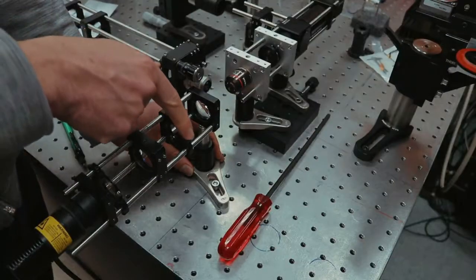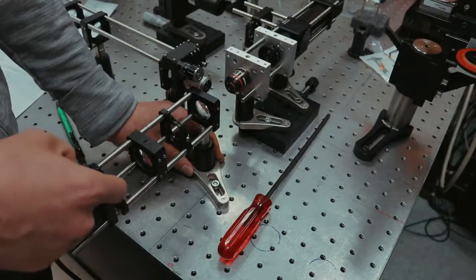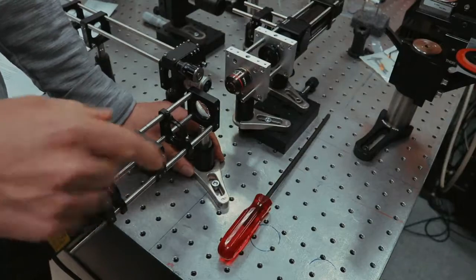Progressively close the field diaphragm until an image of its edges appear on the camera. The image of the field diaphragm should appear sharp and in focus.